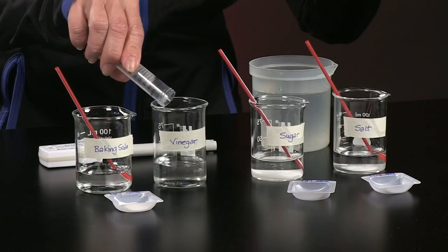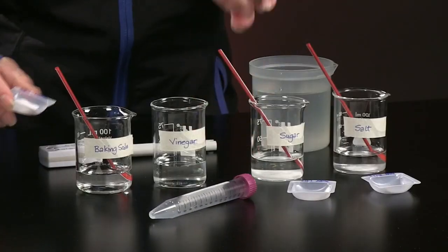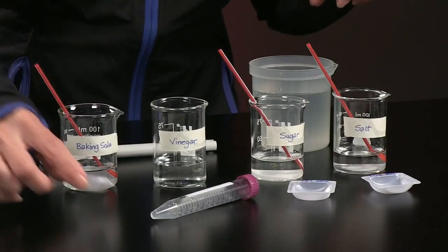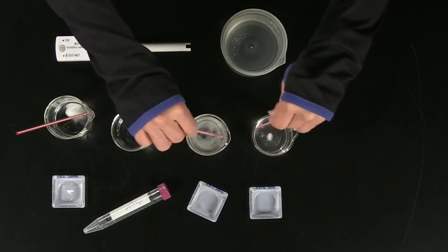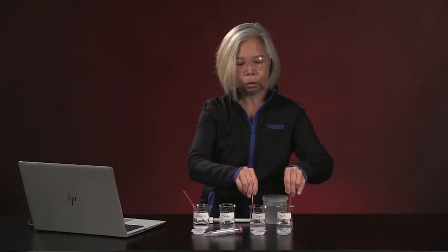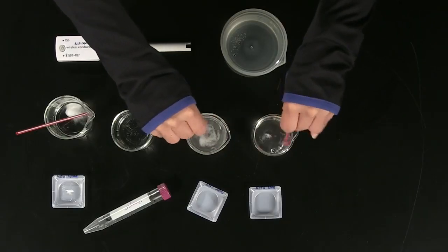We're going to throw that in as well. And finally, our bicarb, sodium bicarbonate being added. And I put these little stir bars in here just to make sure that everything goes into solution, because it's difficult to measure solution conductivity when not all of your material is actually dissolved.